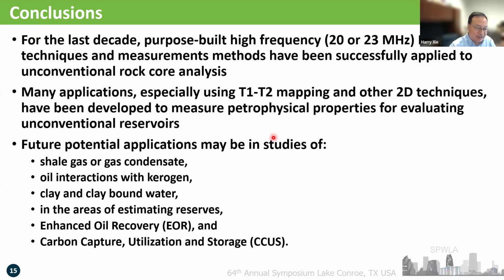And for the future, especially for you students doing PhDs, you should have an open mind about how you are going to apply NMR techniques for your work. For example, if you want to do shale gas or gas condensate, how will the NMR see this? And oil interacting with kerogen: if you have a source rock with kerogen inside and you saturate it with oil, what kind of response are you going to have?